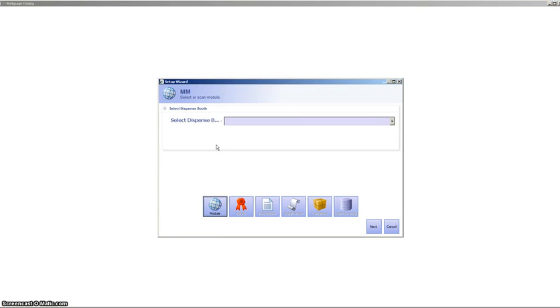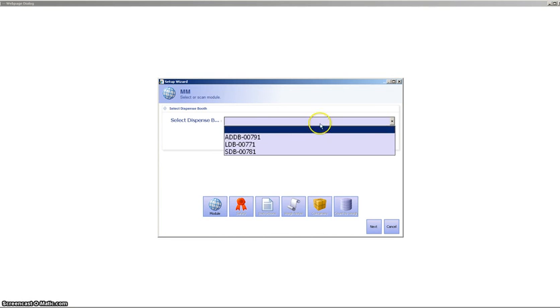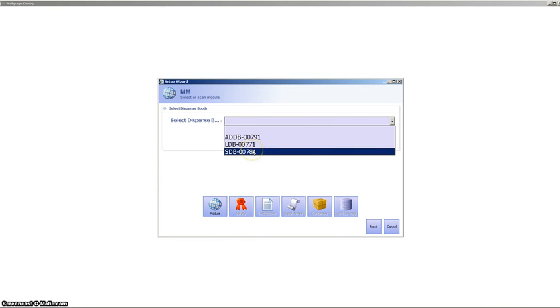So the first thing that we see is it starts a wizard, and the wizard helps guide the operator through all the steps necessary to prepare for the dispensing. So the first thing the operator needs to do is tell it where it's going to be created, and we're going to use our small dispensing booth.